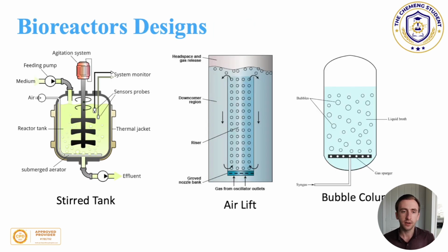Now, generally there are three types of bioreactors in the context of either lab scale or industrial scale. Variations of these do exist.